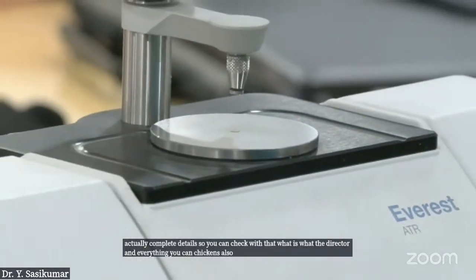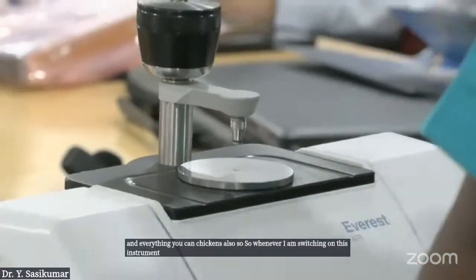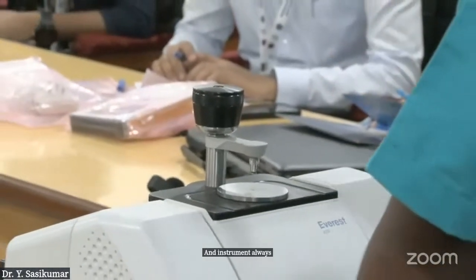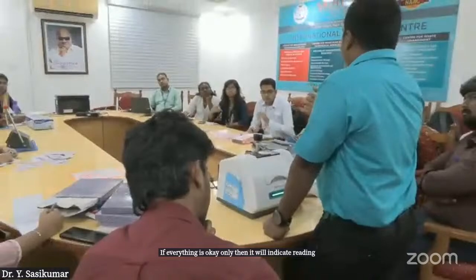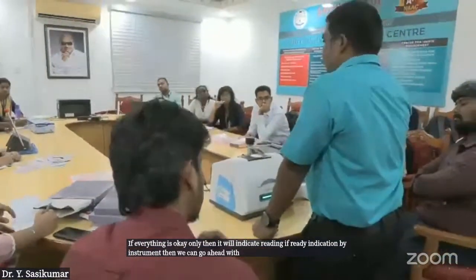So whenever I am switching on this instrument, it will go for initialization, and the instrument always does its own performance check. If everything is okay only, then it will indicate ready. If the instrument indicates ready, then we can go ahead with further analysis of the sample.